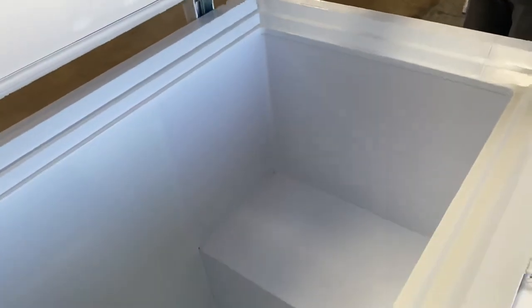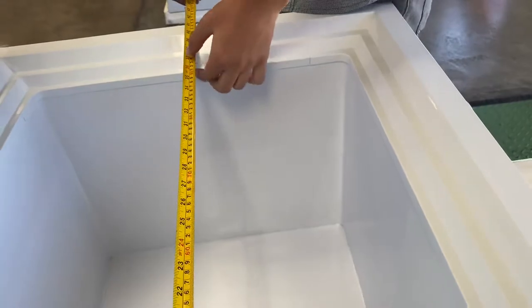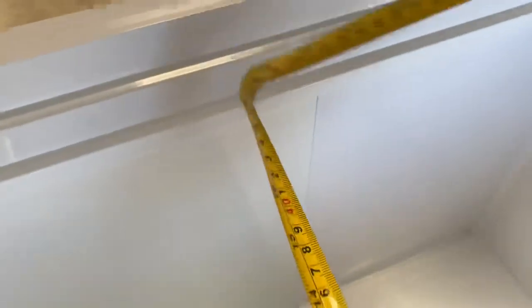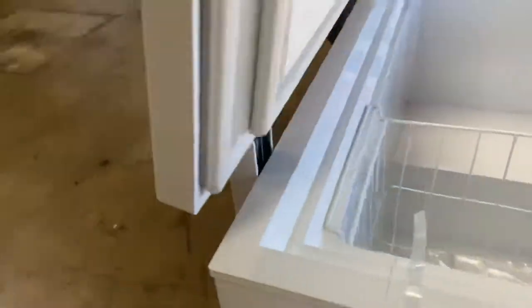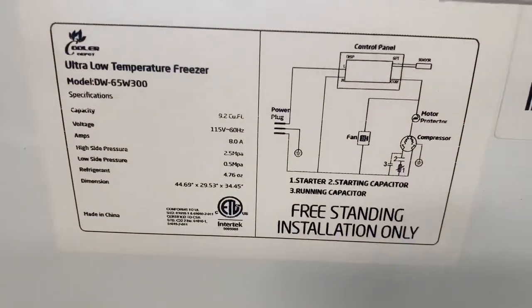Drain included, lock for the doors as well. Baskets included for the inside. Inside measurement: 37 and a half for the length, 19 of the depth, 25 top to bottom. Sticker with all specs located on the back. 110 volt standard US plug — plug is also located on the back.